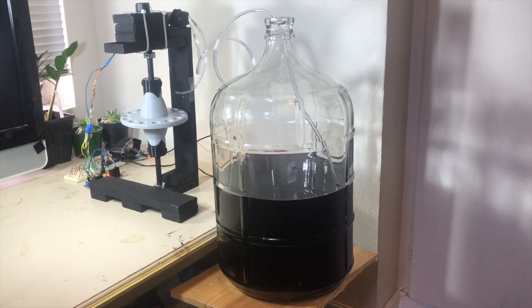Our sensor works by extracting fluid samples from a fermenter or bioreactor, as represented by the carboy to the right, and continuously measuring the ATP in those samples. When graphed over time, these measurements can be characterized as either contaminated or not, based on a classifier that we trained on a dataset we built in-house.